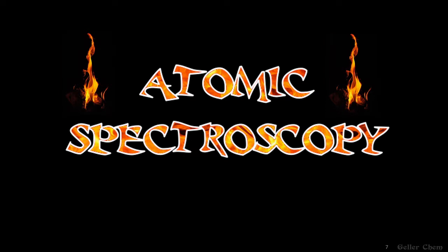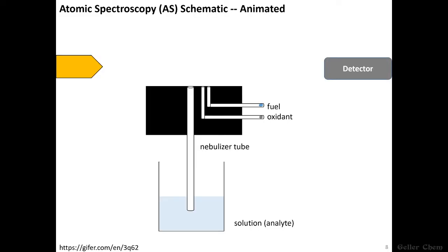Why the fire? Well, because these experiments all involve torching solutions and vaporizing them into gaseous atoms. So first I'm going to go over the instrument itself and the experimental setup, including the part where we light everything on fire, and then I'll go into why we would do this, and then we will finally write some critical notes about it.